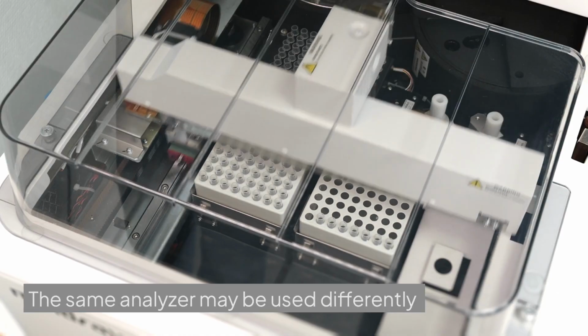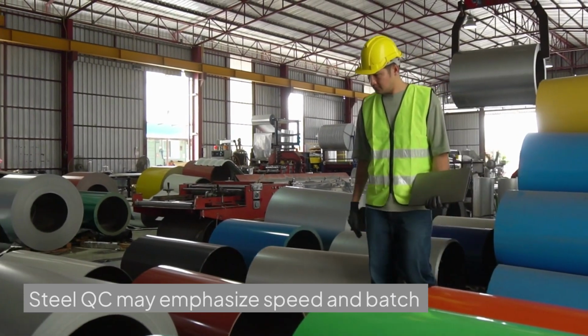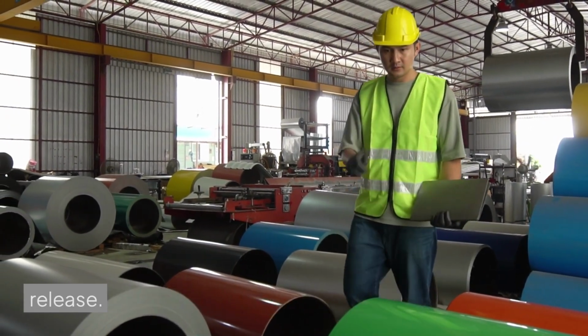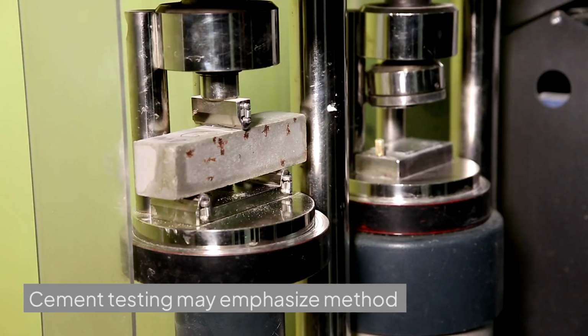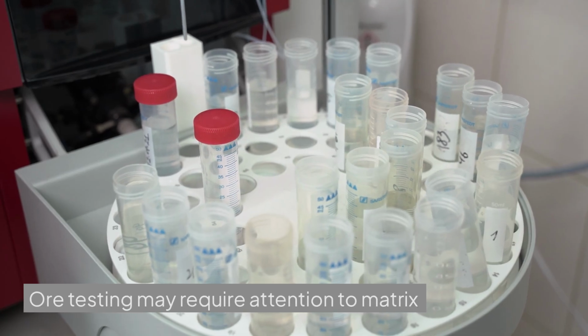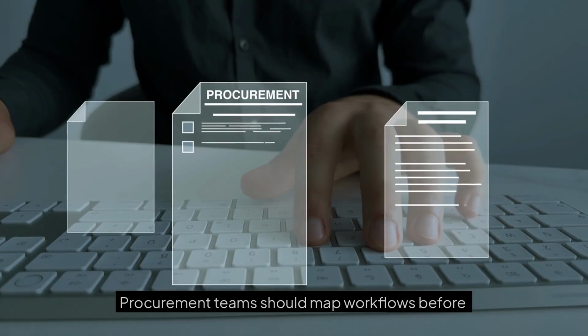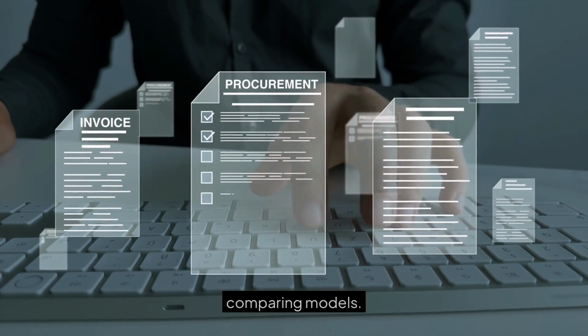2.1 One instrument, several workflows. The same analyzer may be used differently across materials. Steel QC may emphasize speed and batch release. Cement testing may emphasize method consistency and sample preparation. Ore testing may require attention to matrix variation. Procurement teams should map workflows before comparing models.